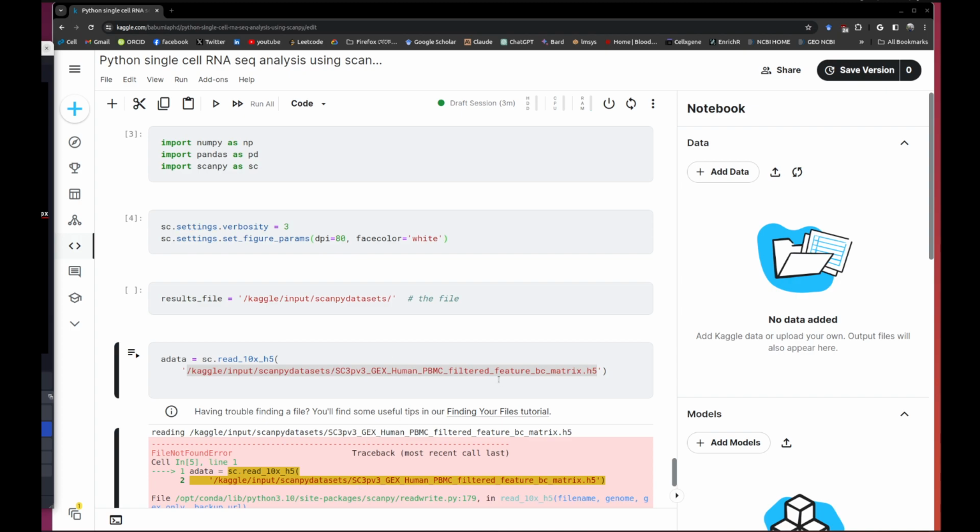So we need to solve it. What's the reason it happened? We don't know now. But we can always solve it.